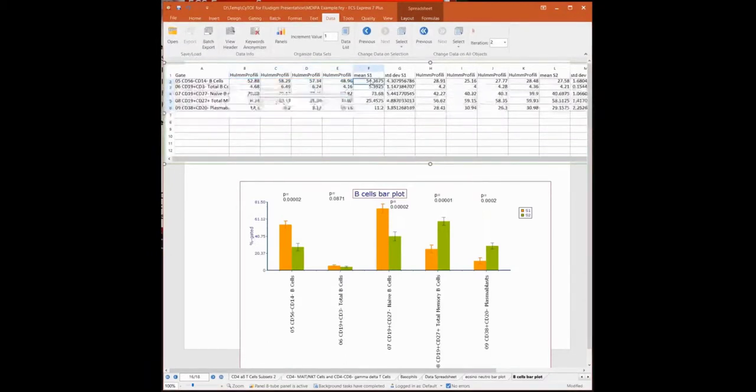But if I click in this cell, mean S1, you can see that you actually can enter Excel formulas and average out the results of all of these 4 populations. Okay, so you can combine all the Excel formulas that you're used to with live updating statistics that are updating as your analysis changes.